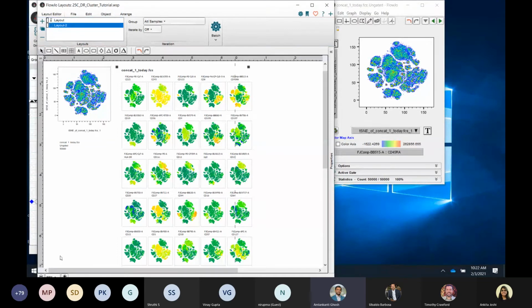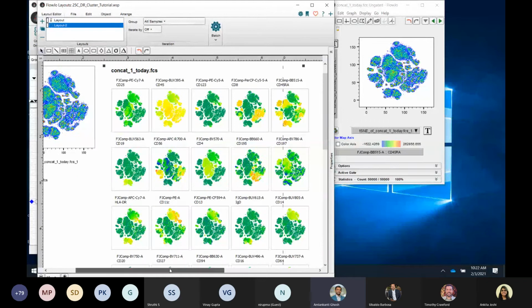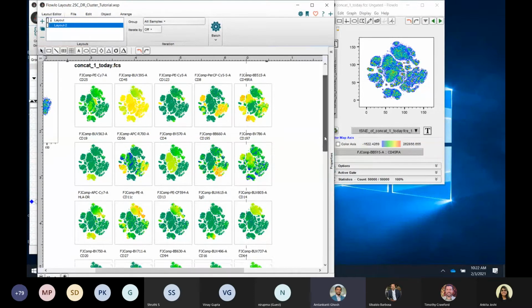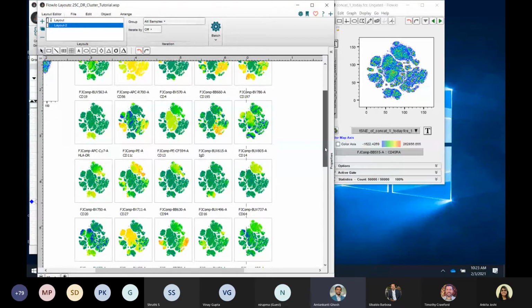It will take a while, and then it will give you the output of 25 different marker expressions across that dimensionally reduced space. Now I'll enlarge this a little bit, and you can see this really helps you to orient yourself with the data. As I was explaining, this is your CD19, this is your CD4s, and maybe this is your CD8 population. Now you can see this is the global structure which t-SNE sometimes fails to preserve. So CD8, you can see it's here as well as here. Ideally, CD8 should be located in one specific island, but see it is broken up into 2 different islands.